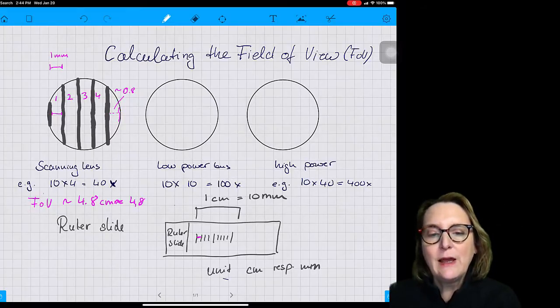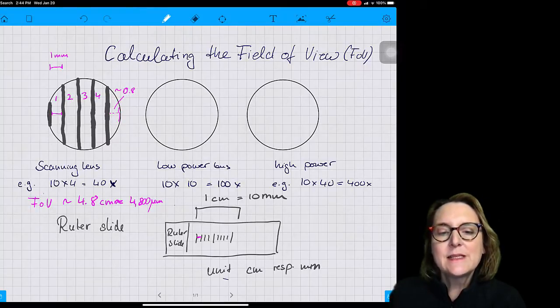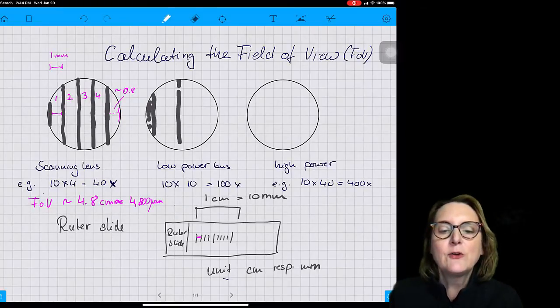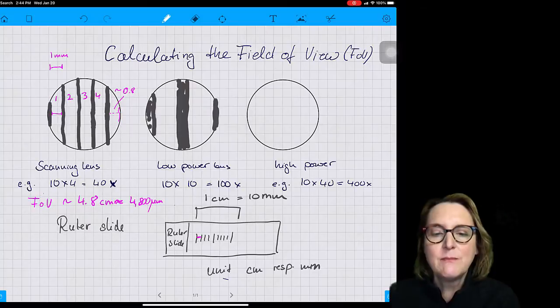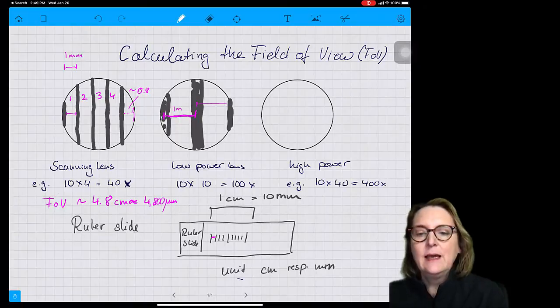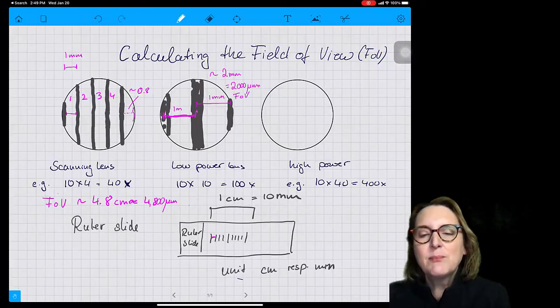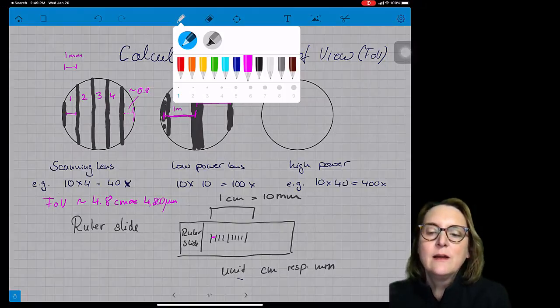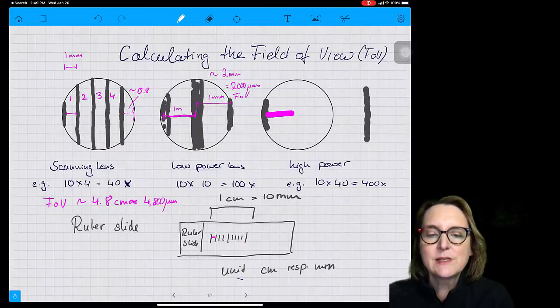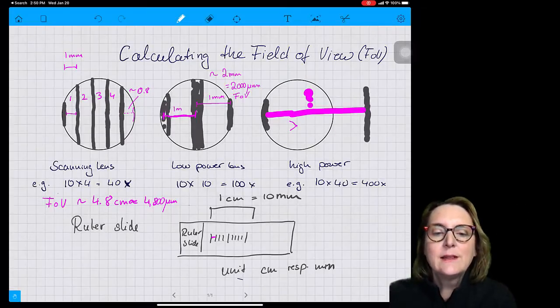When I move to the low power lens, I can still measure my field of view. In that case, the field of view was about 2 millimeters, or 2000 micrometers. When I switched to the high power lens, I could see that my field of view was less than a millimeter — approximately half a millimeter, or 500 micrometers. However, I cannot exactly measure that with this type of ruler slide, but I can calculate the field of view, which is what we're going to learn today.